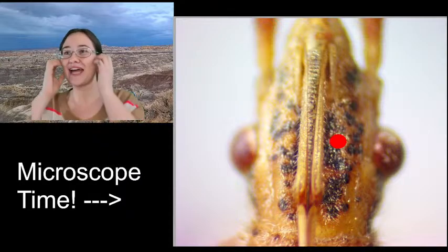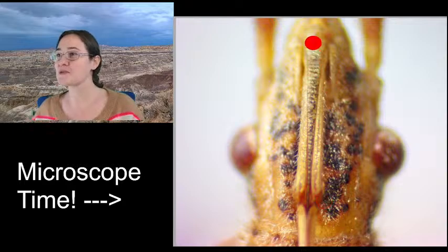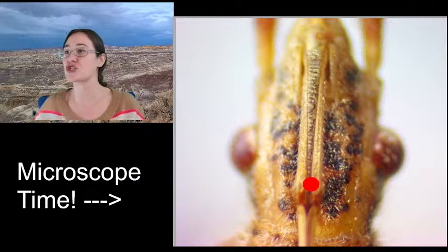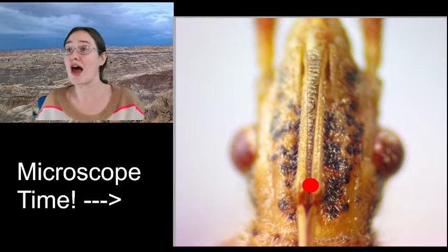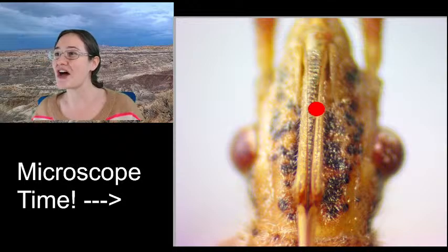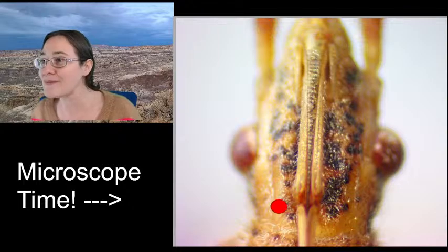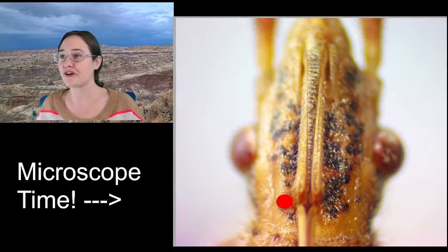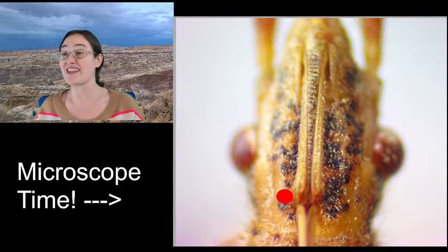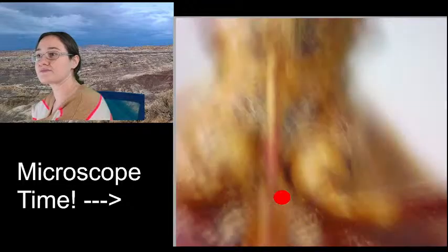they're generally kind of like the side of the head, but if we're looking here, it kind of expands over. And this right here, that's the center mouth part. That's the tube that's his straw, his drinking straw. And then you can see it has all of these little lines along the end. But if we look right about here, I'm going to zoom in even further, and we're going to be able to see the actual straw that he's drinking from.